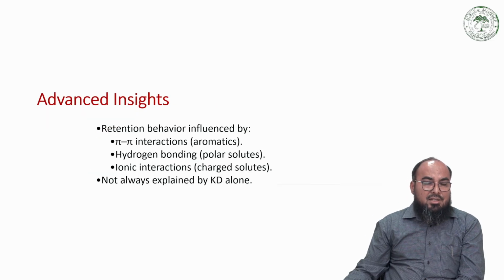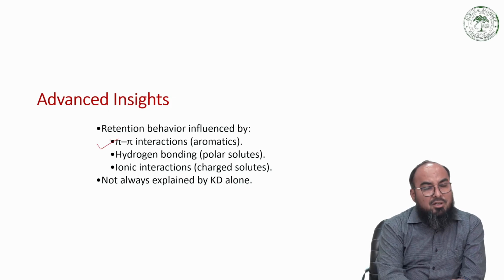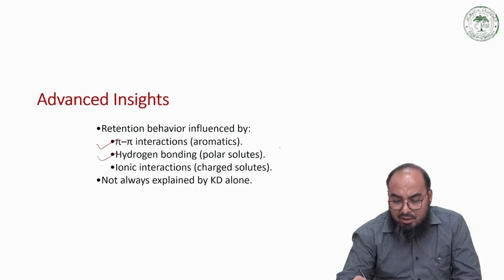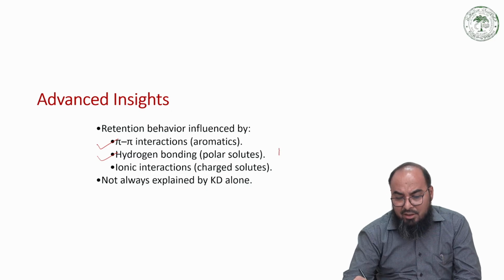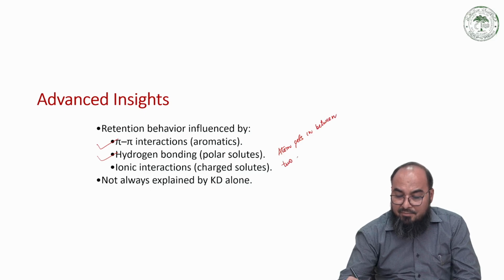Similarly, advanced insights: what are the things going on in the background? Retention behavior is influenced by certain weak interactions. Number one is the pi-pi interaction, which generally happens in the case of aromatic compounds. Similarly, hydrogen bonding, when an atom gets in between two electronegative centers.